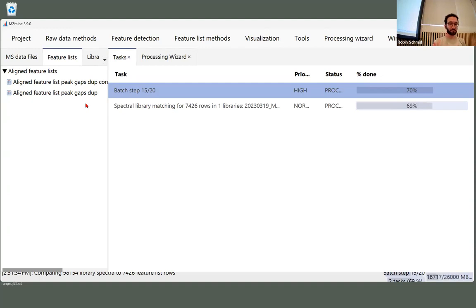Yeah, so that's it. It's running. It's going to produce a very similar output. So there's going to be one feature list. And this one feature list, you can then open, you can explore, you can open the different raw data files, look into the raw data file overview, and also try to find the different annotated features and all those kind of things, and maybe also discuss with your neighbors what kind of problems they usually face in data processing, and also in running the machines and optimizing methods.